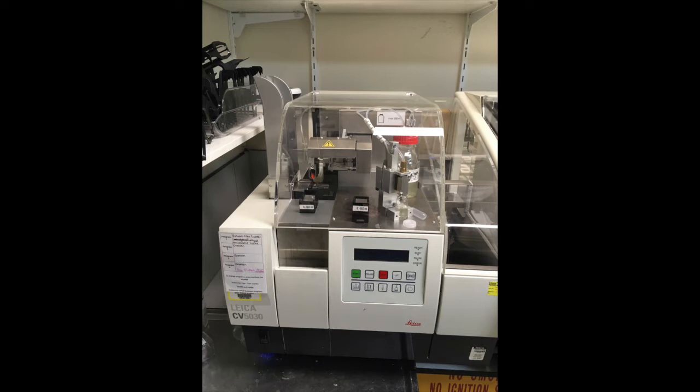So what is the best way to manually cover slip slides? Well, it's important to say at the outset that there really is no one best technique that everyone should follow. Like most things in histology, cover slipping is an acquired skill, and I think the best way for people to learn is by observing different techniques from more experienced colleagues, and then gradually over time you can perfect your own personal technique.